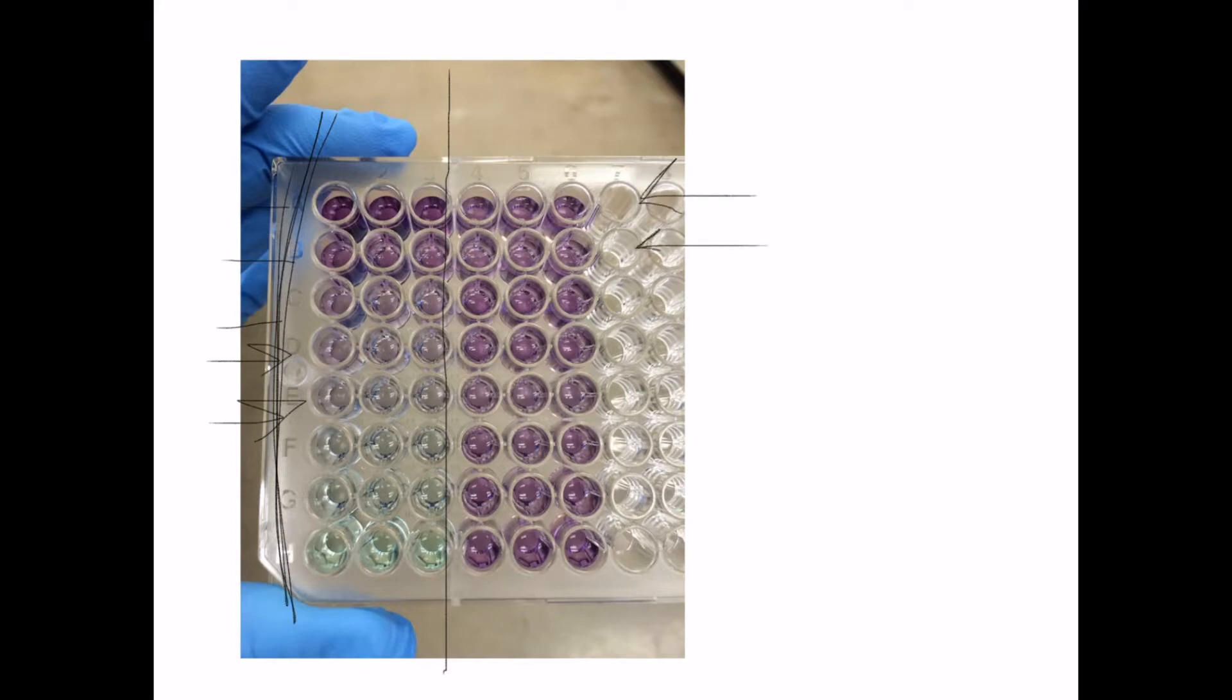So the reason some of these are purple is because when you add it initially, it turns green, but when you add something called a working reagent, which is what makes the BCA assay work, it stains the solution purple, and the more protein there is, the more purple it turns the solution.